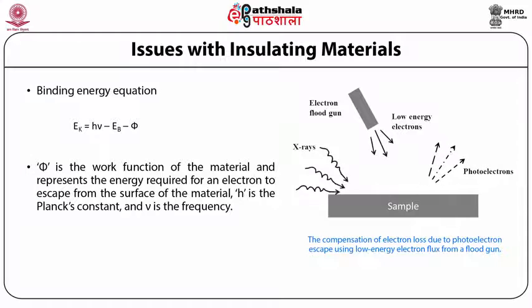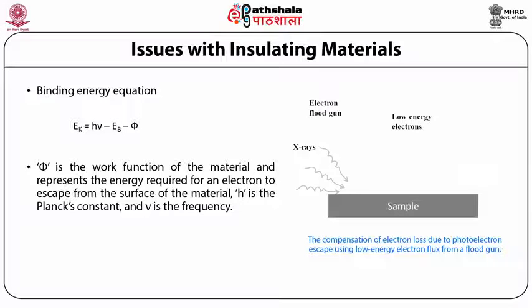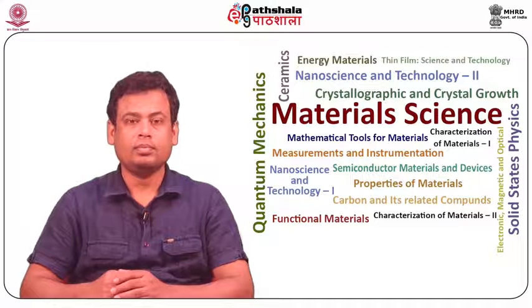Hence, the use of non-monochromatic X-rays has the identical effect as using an electron gun.